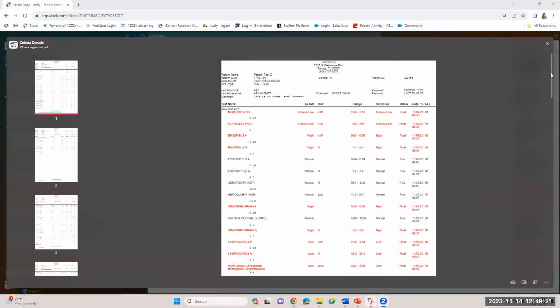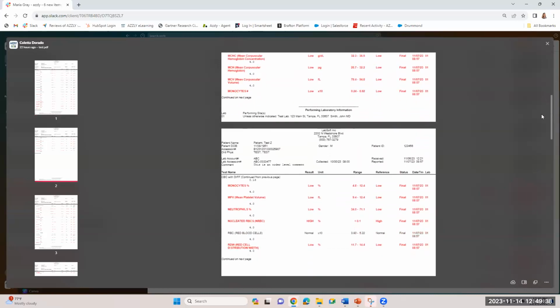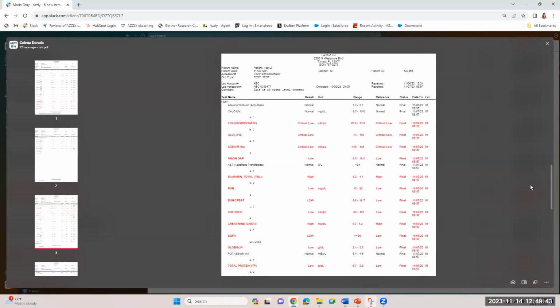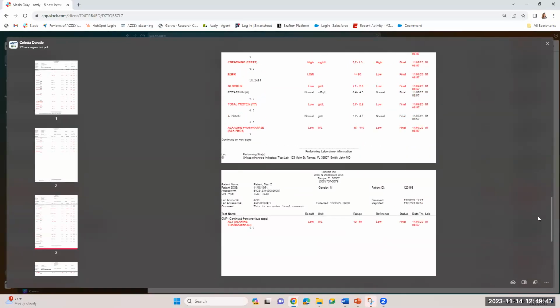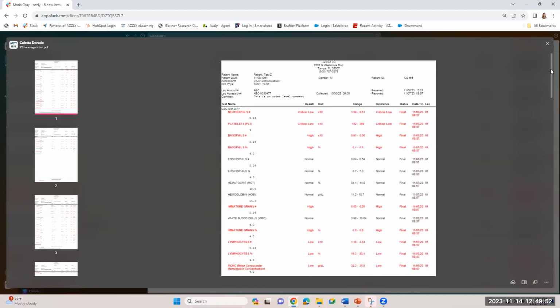Okay, and this was mentioned that instead of the results coming through the LIS in the text format, or possibly we can receive it in both formats, this is the way the abnormals would read. What I'd like from today's audience, your feedback, is this a format that you would prefer, or would you like both the text as well as this format to be able to receive?